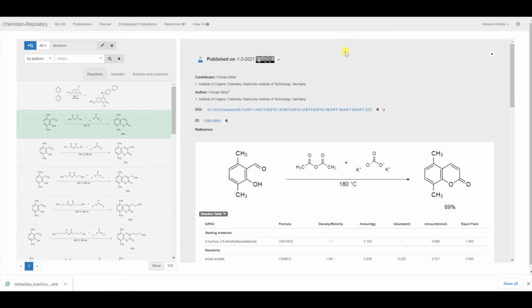There's one special feature of the repository which is a bit hidden, so not that prominent. This is this function here. It can be used if you have any comments about the reaction. If you see any mistakes, then you can contact the team of Chemotion and give your indication or whatever you think about the reaction and possible problems, and then we review that, and if that's true, we will add it as information to the reaction so that further users may see those problems that might occur.